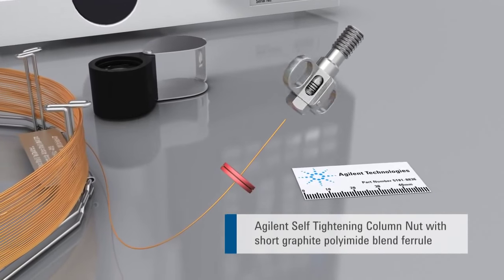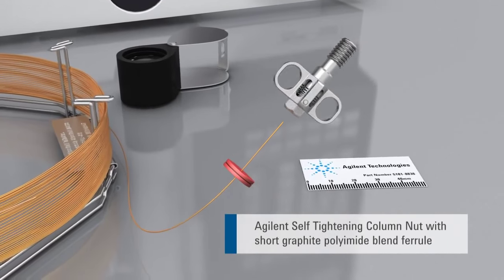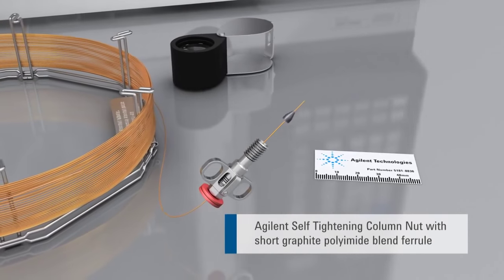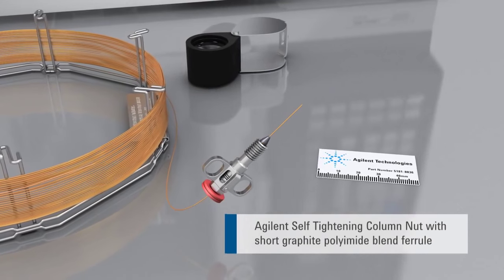Innovative self-tightening column nuts keep the seal from leaking following thermal cycling. There is no need to re-tighten fittings to fix leaks caused by the ferrule shrinking.